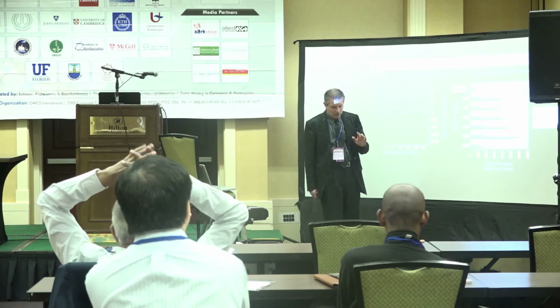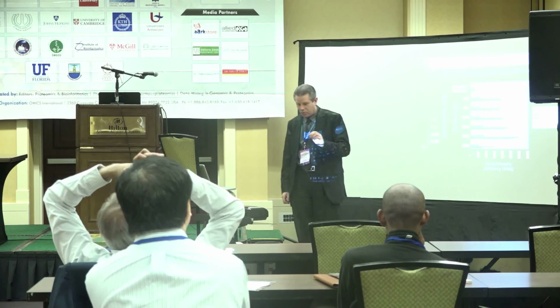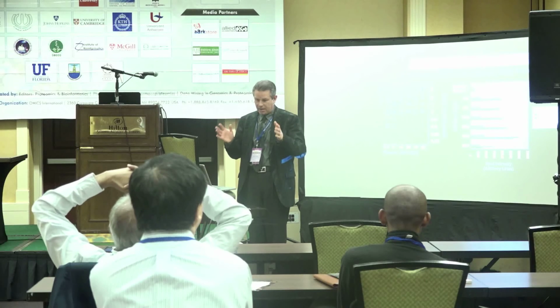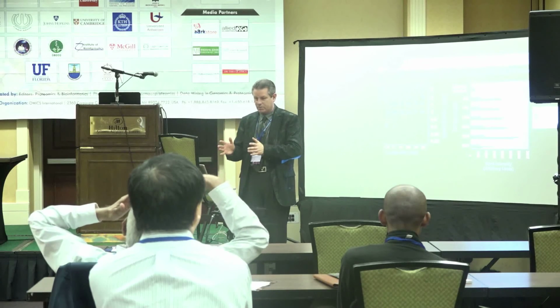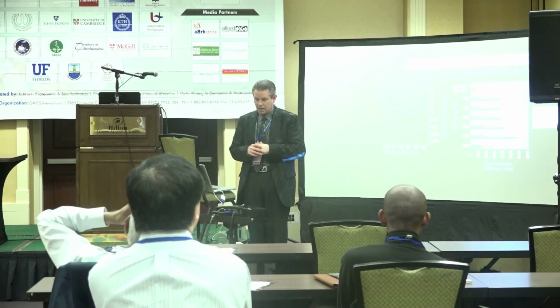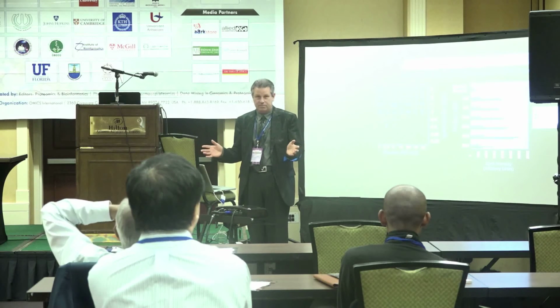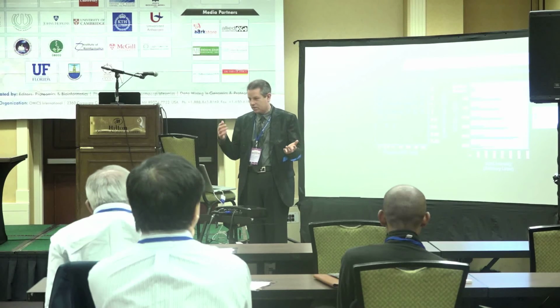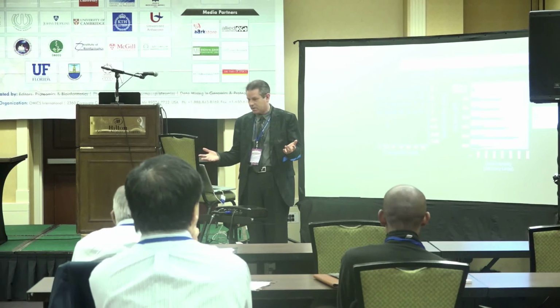courses. I had a hell of a time dealing with A431 cells with EGF treatment. We did Western blots with antibodies that we developed for the EGF receptor tyrosine phosphorylation sites. And when we took 5 minutes treatment with EGF, we got no signals. And I thought, well, is the EGF gone wrong? Is it the cells or something happened to the cells?